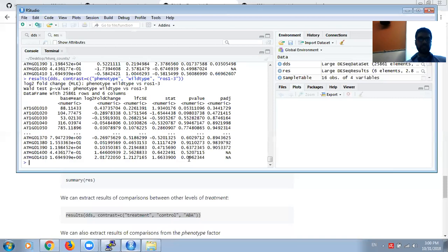And it again gives you another set of data where you can say that the first gene, 1010, has 0.43 expression level higher than the control, with the p-adjusted value of this amount.